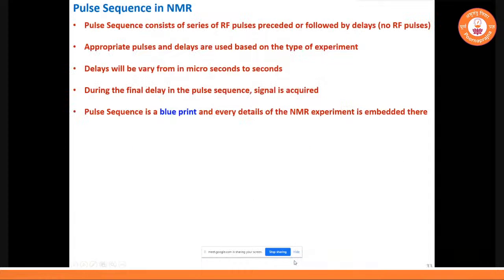Okay, now coming to the main part. NMR is always parameter dependent. So we should know which parameters are important while running the NMR experiment, and now we'll see how to record an NMR spectrum. Nowadays most of the machines are automated. It is like a black box. We don't know what is happening inside. Finally, we'll get a spectrum. Sometimes we will not get a spectrum, and we never understand why. So as a spectroscopist, you should know some important parameters to understand why we didn't get a spectrum, or which parameters to adjust so that we get a good and neat spectrum.